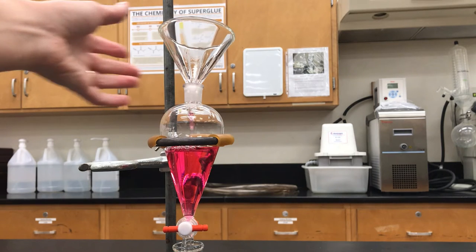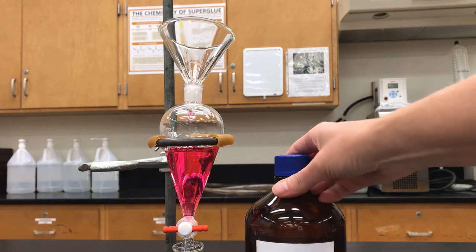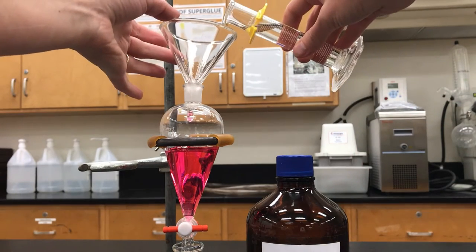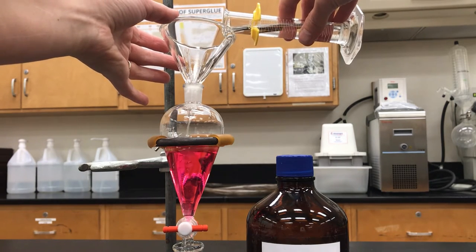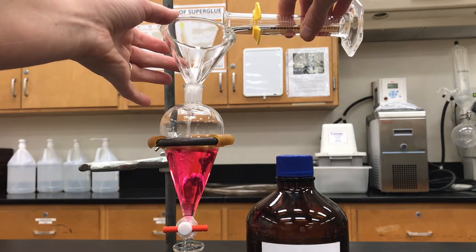This pink solution is aqueous, it's acidic, and it has some methyl red indicator molecules in it — that's what gives it the color. What I'm now going to add is ethyl acetate, which is an organic solvent and it's what I want to extract the methyl red into. We add that using the funnel as well.